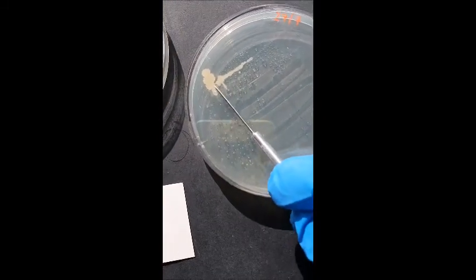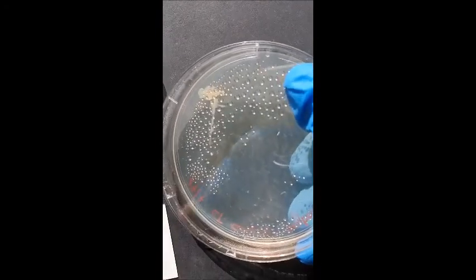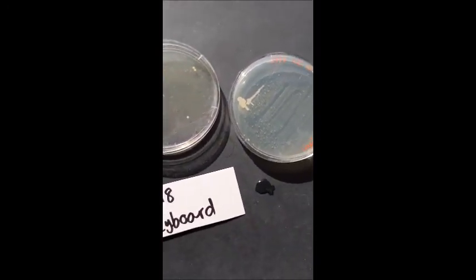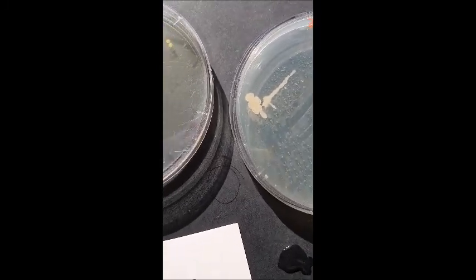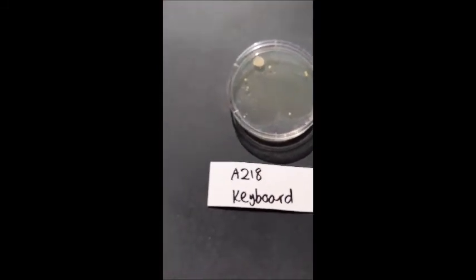And then this, look at this blobby action. That's just completely different to anything we've seen in the other ones. Interesting. So again, yeah, that could be a fungus. Actually, no, I think funguses are more feathery and have more strands. I'm pretty confident they're all bacterias. But yeah, just interesting to show the differences.